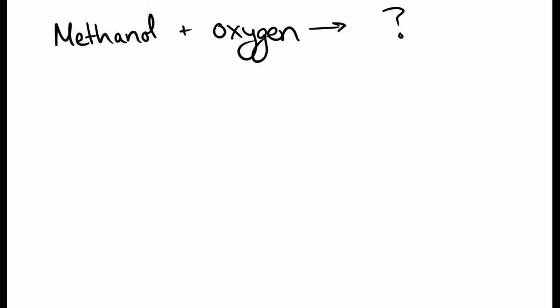Before we really do anything, I want to show you a little bit of a demonstration. I can't show it to you in real life, but I can try to show it to you through the magic of video. We're going to have some methanol, which I poured into a big water jug that you're about to see in a second. We're going to try and react that methanol with oxygen. Without saying too much, I'm going to let the video speak for itself. So have fun and enjoy.